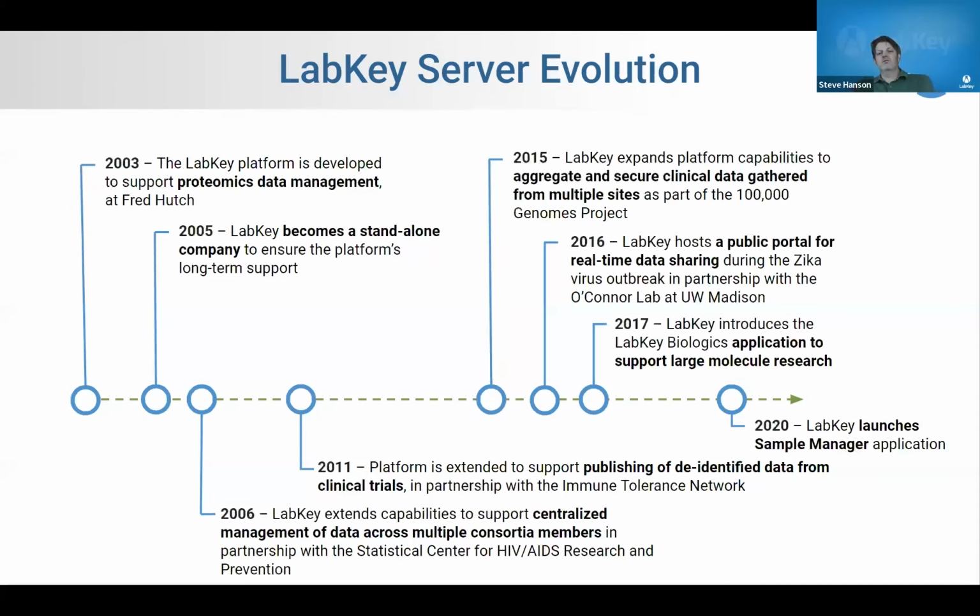But before we even get to those questions, it's nice to get a little sense of where LabKey came from. How did this thing arise in the world? Well, LabKey Server, the company, really began, gosh, 23 years ago now, back in 2003.